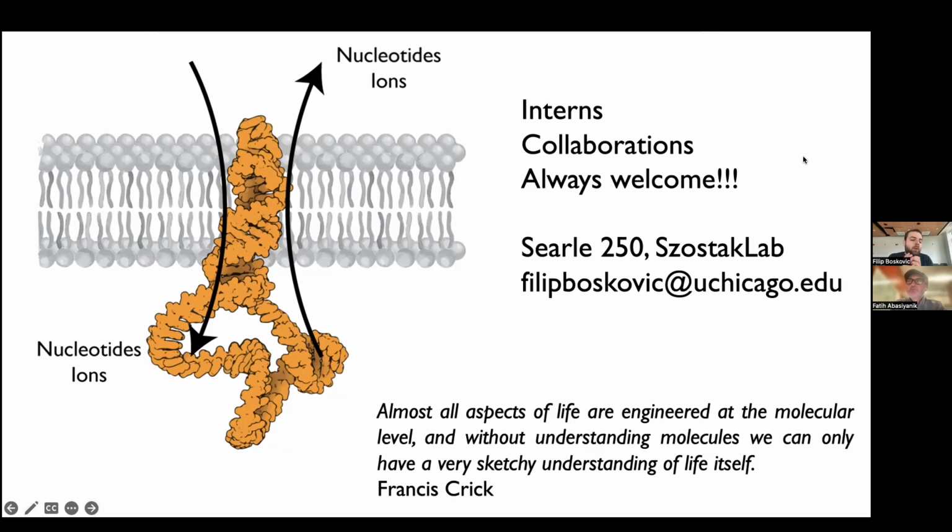The nanopore, I think people use nanopore for a lot of stuff like that. So you can see in most papers, very nice. They just say, oh, we added 500 nanograms of DNA. We use the same sample. So you basically just repeat the same. It should work. Even if you have a bit of variation, it still should work. It's not like with Illumina. In Illumina, you need to have a certain range of DNA concentration, right? With nanopores, it's a bit more flexible.